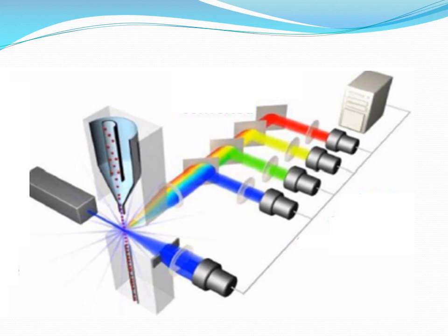When they pass through this interrogation point, these fluorophores get excited and emit fluorescence. This fluorescence emitted is detected with the help of mirrors, which are again placed at right angle, similar to the side scatter detectors. Now, using these filters, we are basically filtering different wavelengths of the emitted light that is emitted by the fluorophores when they return back to their ground state. Now this fluorescence data is collected in a similar manner, and then it is analyzed.